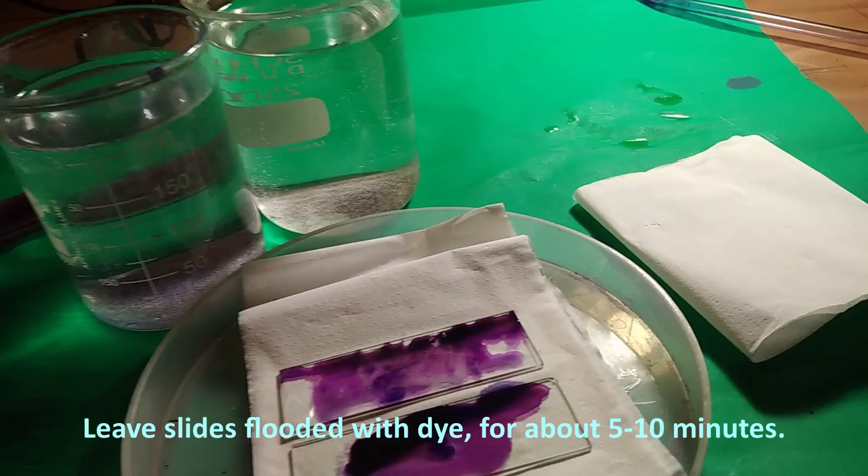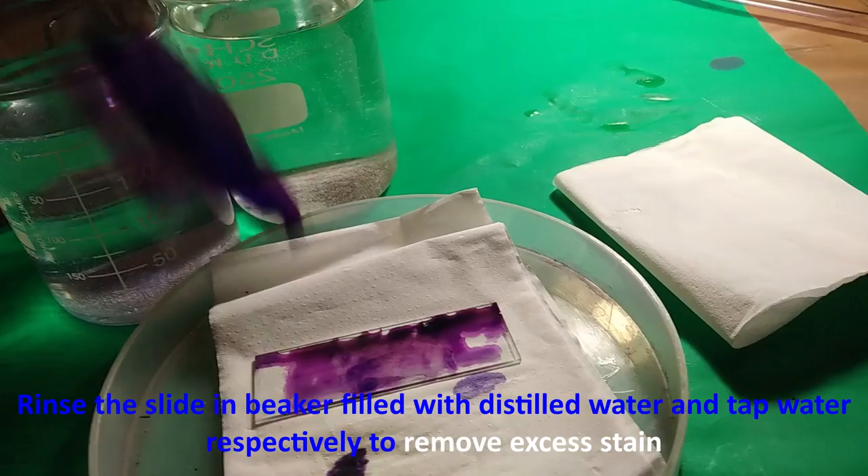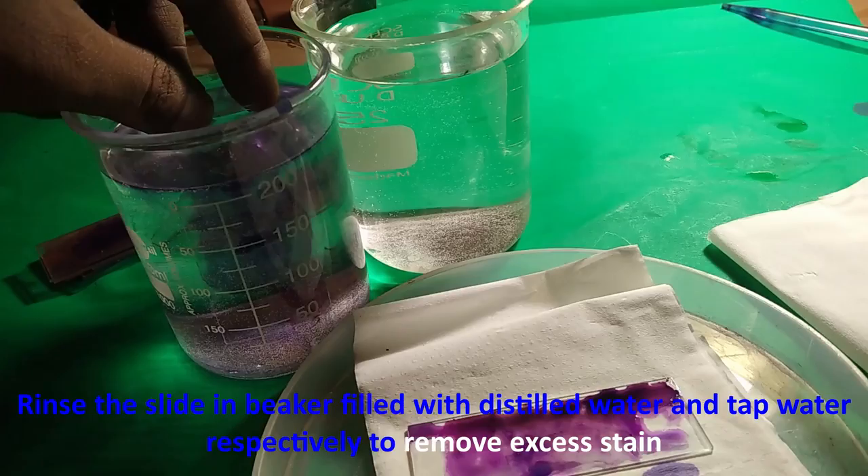Then rinse the slide in a beaker filled with distilled water and tap water, respectively, to remove excess stain.